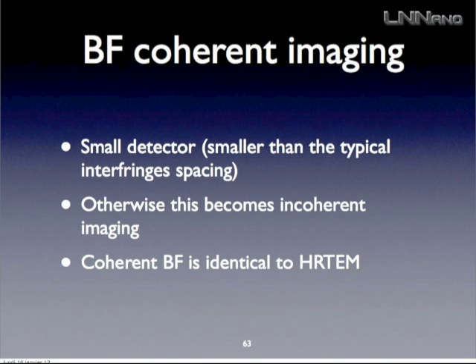And if you take a larger one, it can be interesting, but you will begin to make some incoherent imaging, or maybe something which is a little bit incoherent, or not coherent. It may be tricky. So in that case, maybe it's worth making HAADF. And as a final word, I would say coherent bright field is identical to high resolution TEM.